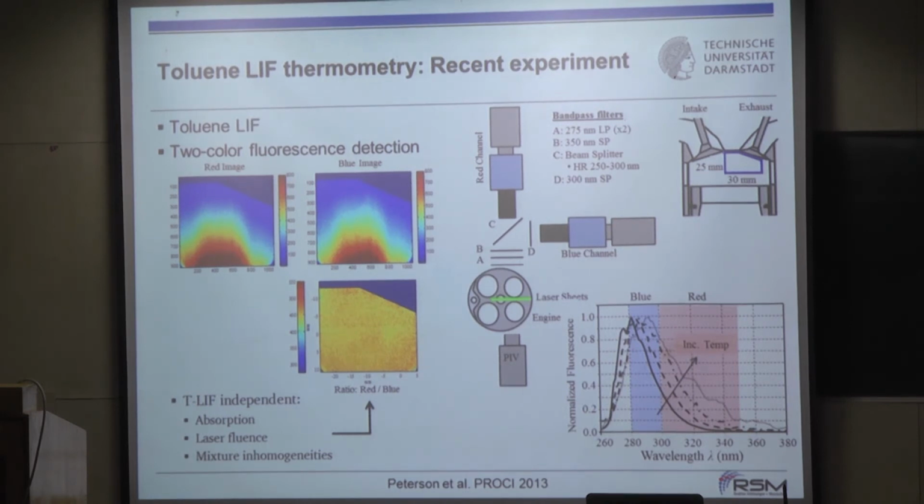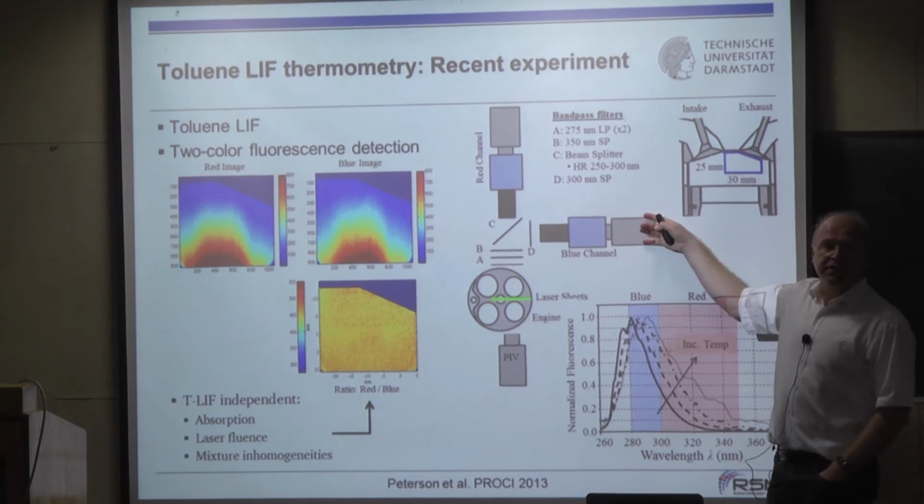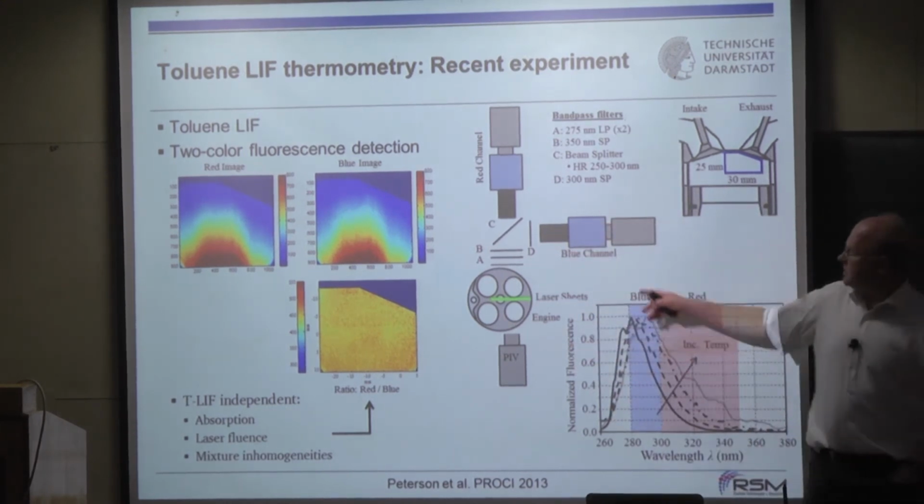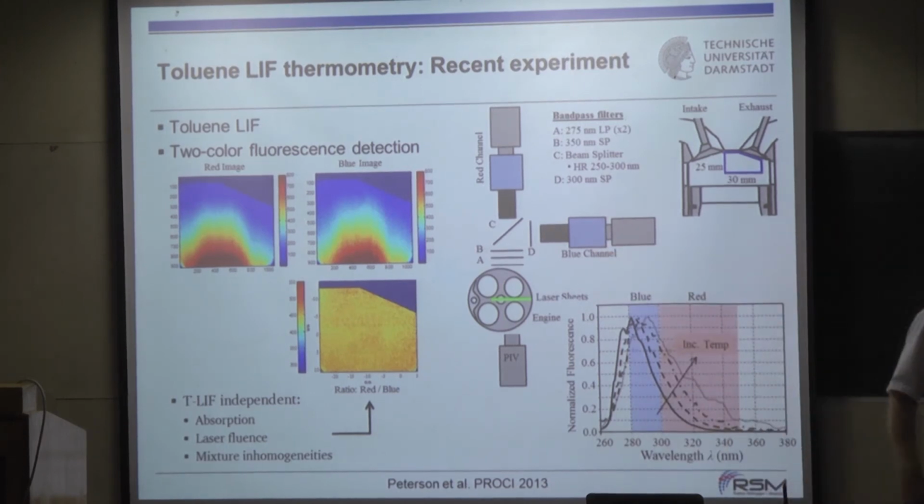You can, with this kind of cameras, you mean? You can, yeah, sure. Those cameras themselves are not UV sensitive, but with the intensifiers they are. With those devices, you, for example, can measure down to OH chemiluminescence at 308 nanometers. You can measure CH star chemiluminescence at 430. You can measure as well, without the intensifiers, the soot emission if you wish.